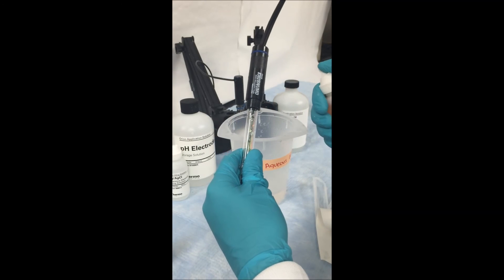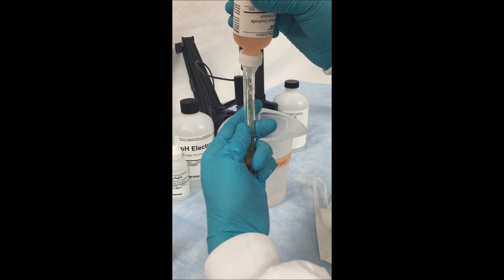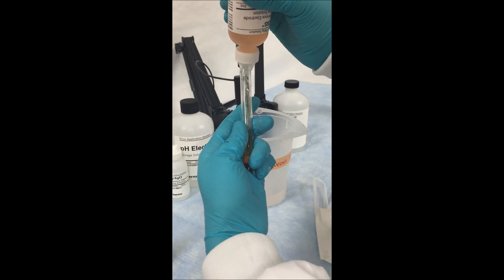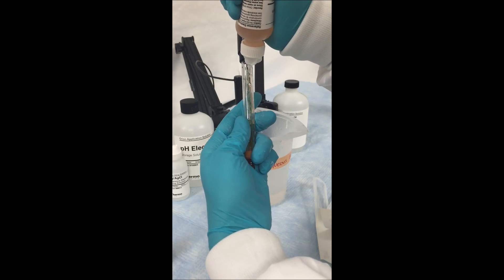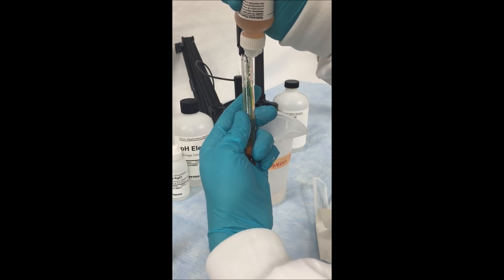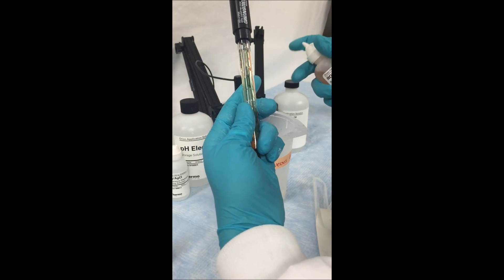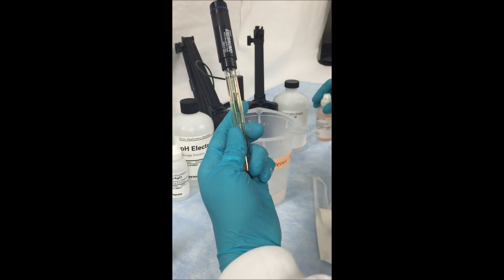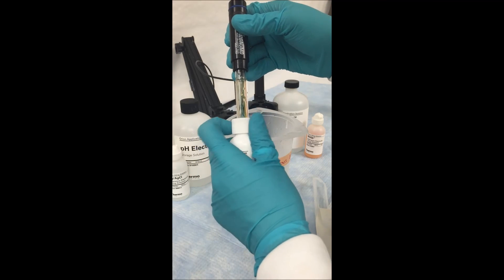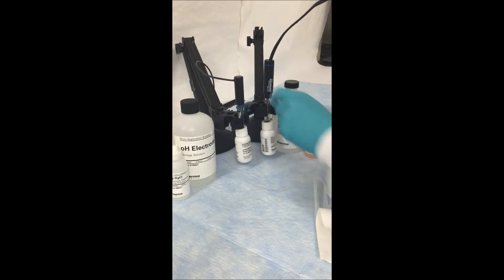Then, using the appropriate fill solution, top off the electrode by inserting the tip of the filling bottle into the fill hole and filling it all the way up. Since this is a refillable electrode, make sure every day before using it that your inner chamber is filled with inner fill solution so that you have the best results. Once it is filled, you may start either sampling or put it back into storage.